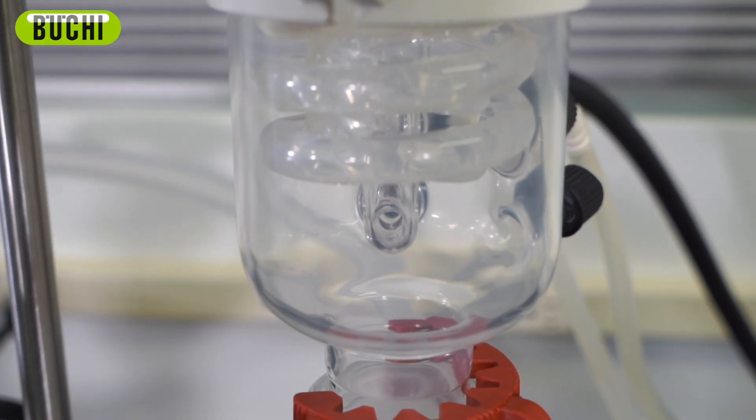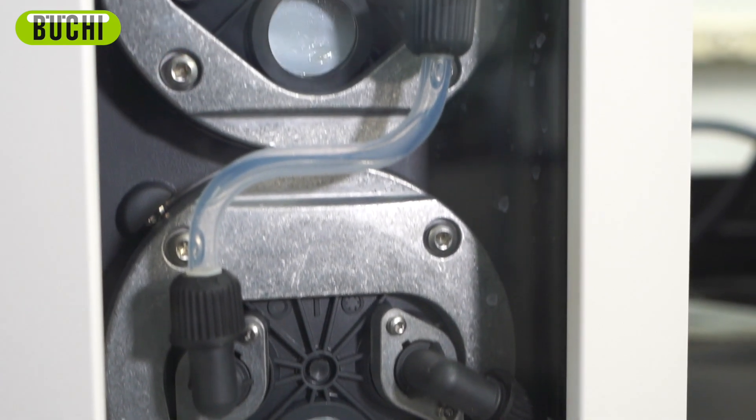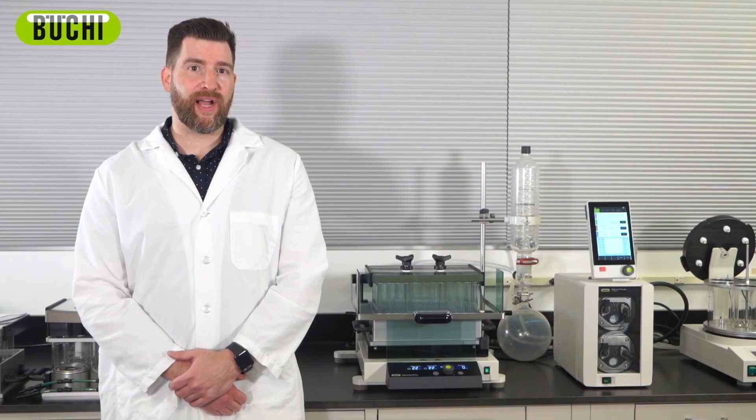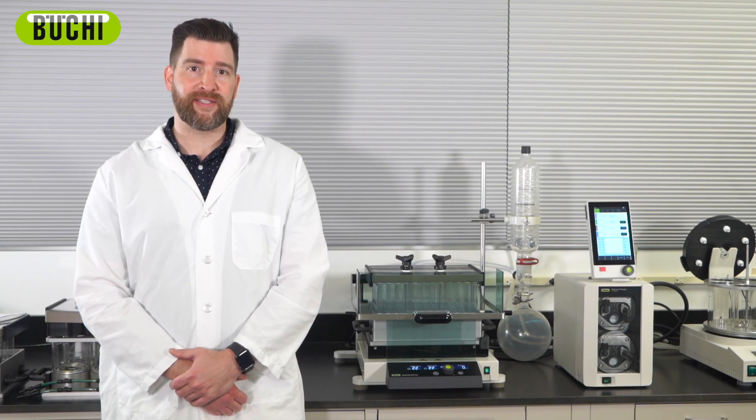The Buchi Syncor Plus performs a fast and gentle evaporation process by using vacuum vortex rotation. Even when using high boiling point solvents such as water, DMSO, or DMF, this ensures the protection of volatile and heat sensitive analytes.